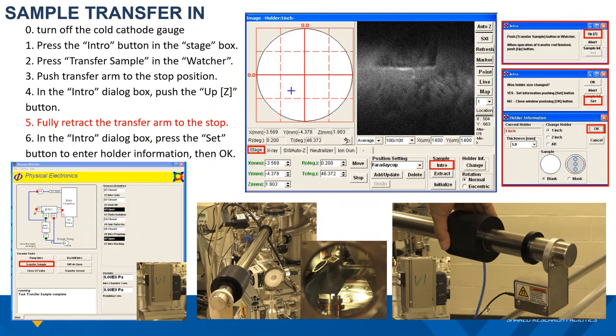Once the cold cathode gauge reads 1.2×10⁻⁶ Torr, we will move forward to transfer the sample. Before the process, go ahead and shut down the cold cathode gauge. Then go to the Phi Summit software, locate the electronic control panel, click the sample stage tab. This will bring the stage control interface to the front panel. Then click the sample intro button, which will move the sample stage to the loading position and bring up the small intro window.